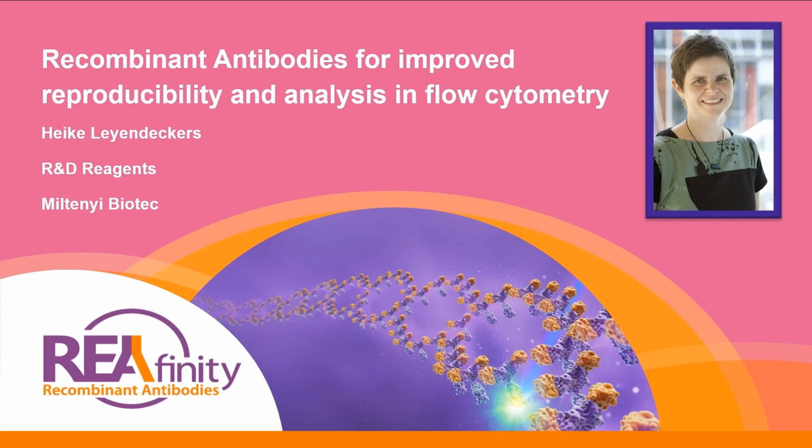In the first half of this webinar, I will talk to you about recombinant antibodies and why they are the better choice for flow cytometry.